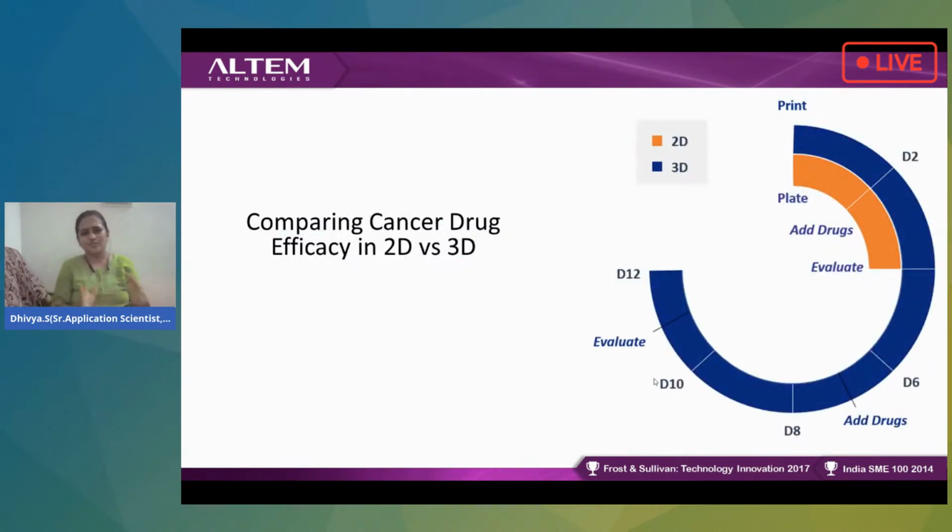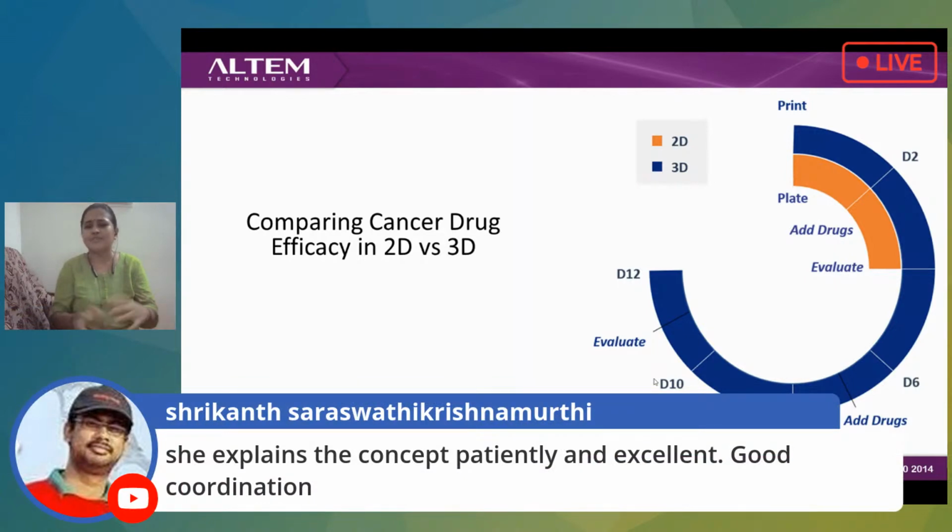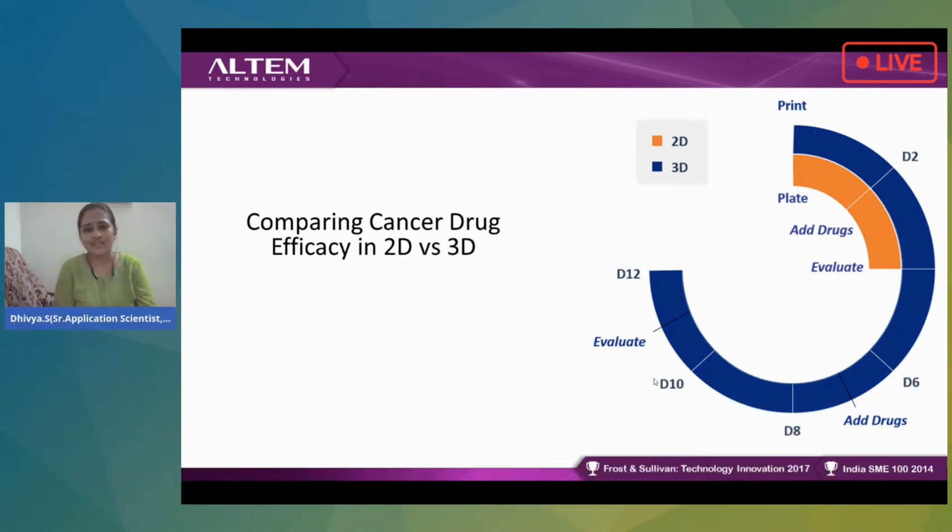So as of now, you have only seen the methodology that we followed. Now you may be wondering how efficient this is, 2D versus 3D. Let's see comparative results published in Cell, which state that 3D cell culturing technology with 3D models has more advantages compared to 2D, especially in the treatment of cancer. So let's see those, because we know that cancer is a complex disease, and treating cancer is a very hard task, and how this 3D technology is going to help accelerate the drug discovery process.